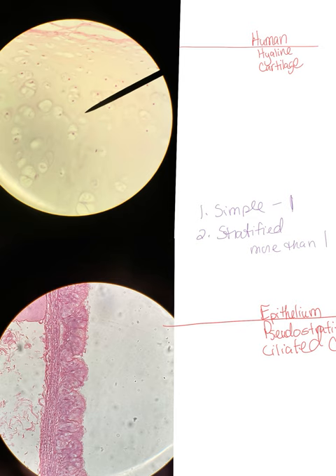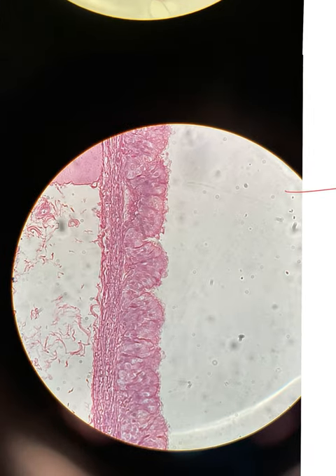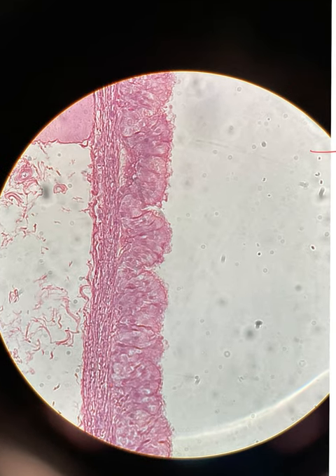Then you have something that's called pseudostratified. Pseudo just means false, and stratified means more than one. So what we have here are some columnar cells. Let me go back so I can zoom in. And so columnar are generally rectangular shaped. But here, they're all like squished together. They're not actually more than one. And see, you can tell here, here's the basement membrane. Remember, we're looking from the white area straight onto the very first thing we see. And we see just sort of like this blob.